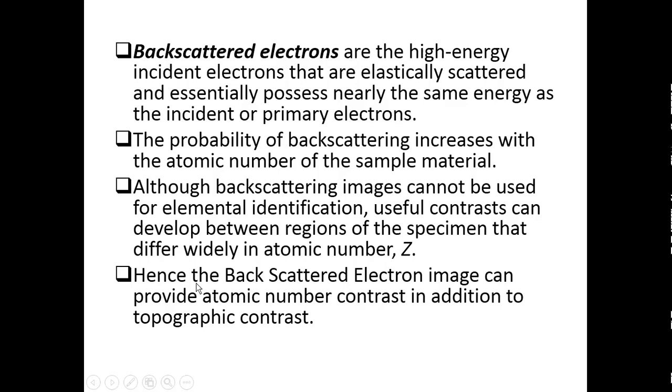Okay, in addition to that, the topographic information of the images of the sample is also studied, so that the topographic contrast, whether there are any nano defects or any kind of variations over the surface, could be identified and understood with this method due to the measurement of backscattered electrons and energy and all.